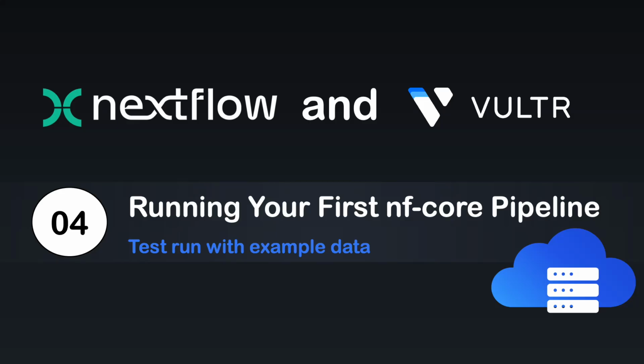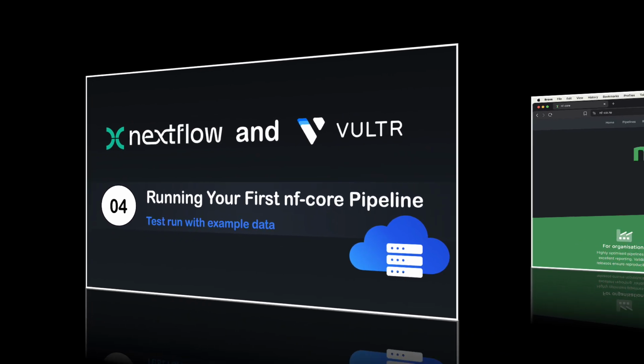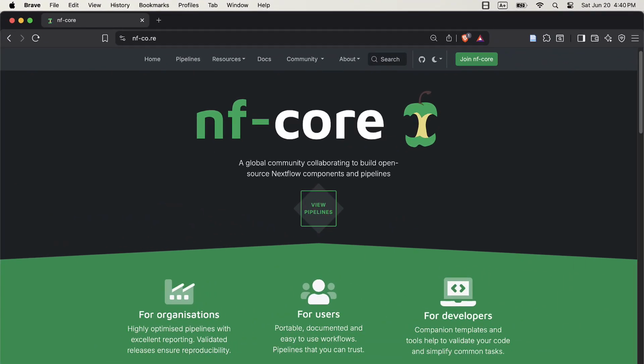Hey everyone, welcome back. In this video, we'll run our first NF Core pipeline using Nextflow on our cloud server. Let's get started. So very quickly, what is NF Core?